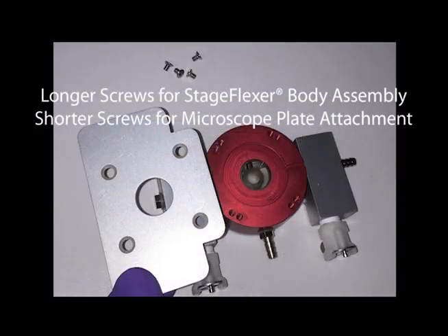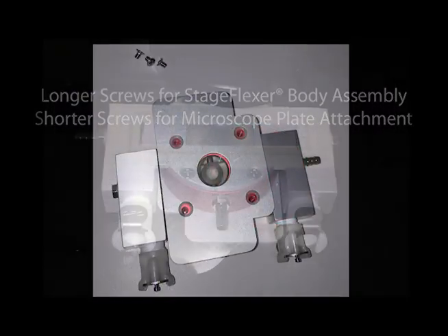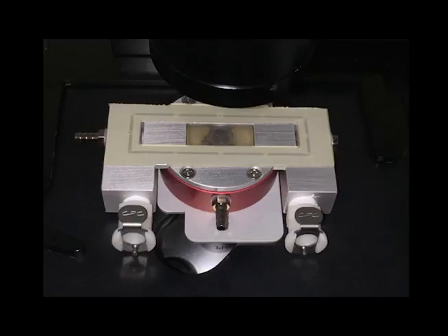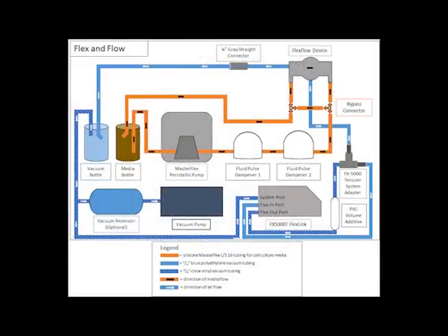If needed, attach the microscope base plate to the bottom of the stage flexor body with the four provided screws. Your FlexFlow device is now assembled. Next, we'll connect the tubing and set up the flow system. It may be helpful to put all your system components in their desired position before cutting the tubing.